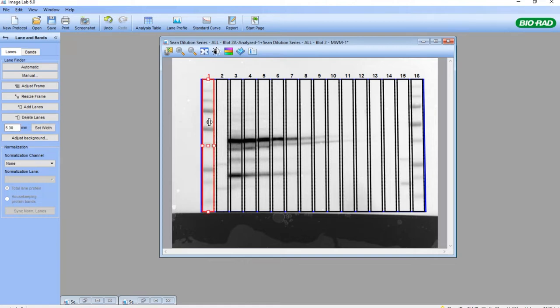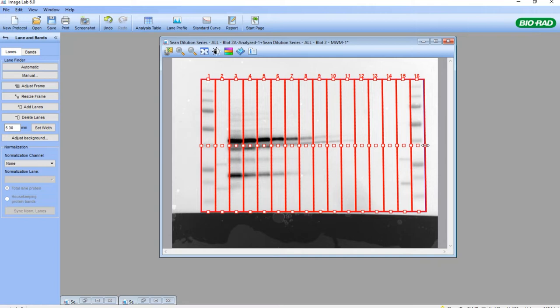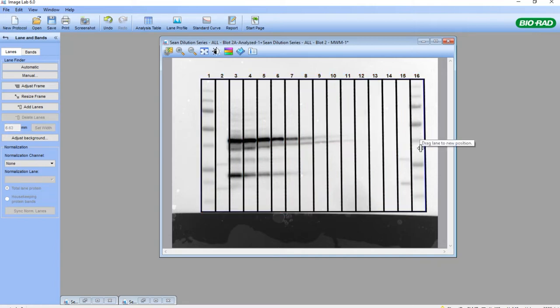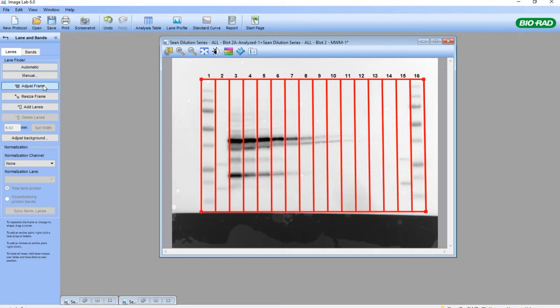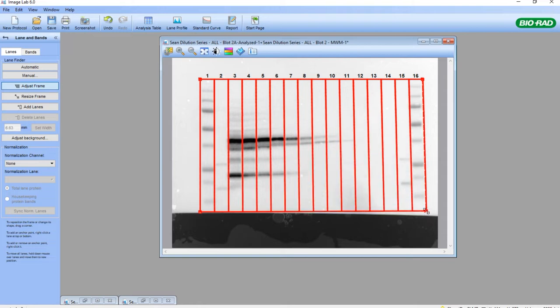I'm going to select all lanes by selecting the first lane, clicking into it, holding the Shift button, and clicking on the last lane. Then I can select any one of the anchors on the side of any of these lanes, because they're all selected. I click and drag to adjust the width so that all the bands for each of the markers and individual lanes are inside the lanes. I can again click on Adjust Frame and move it slightly to assure proper alignment.